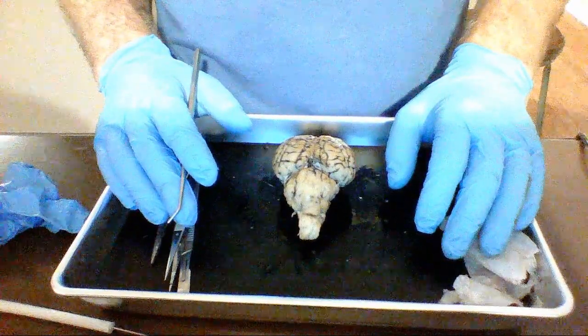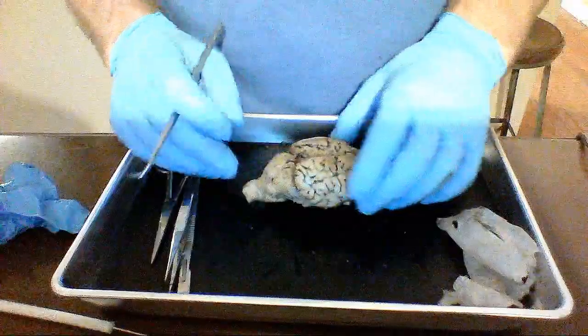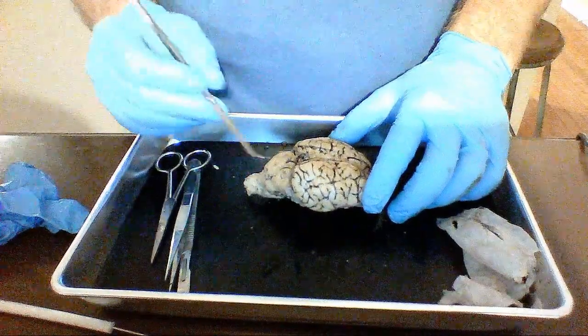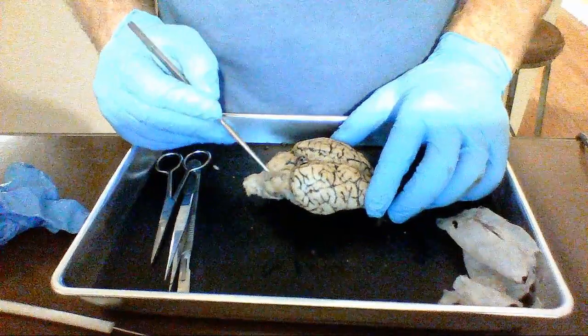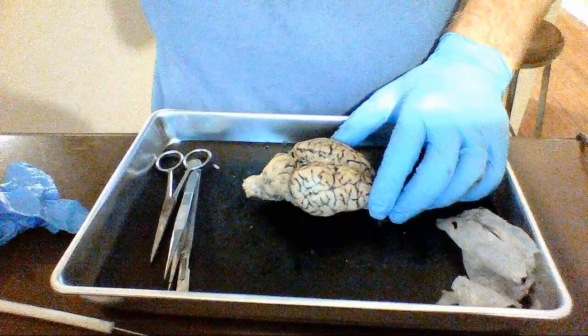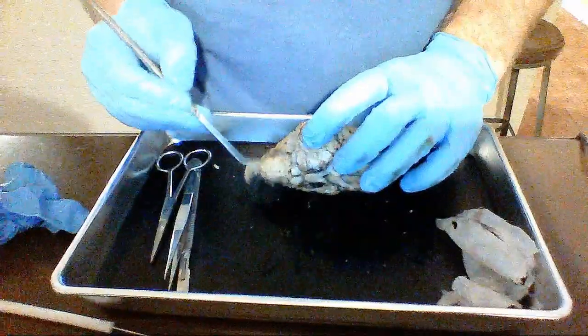Okay. So behind your occipital, more posterior, you've got the cerebellum. Look in there. The cerebellum is important for motor movements, smoothing out movements, and it's beautiful inside. And then behind that, you'll be going down to the spinal cord.